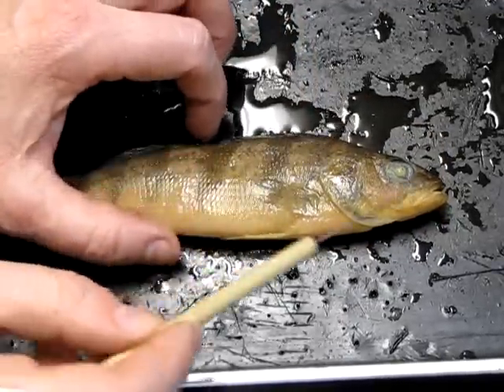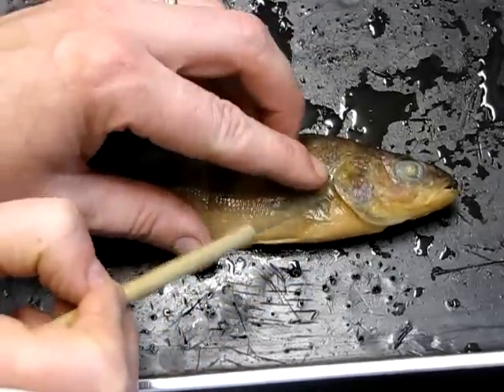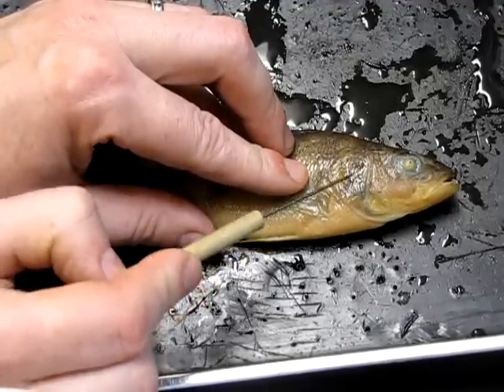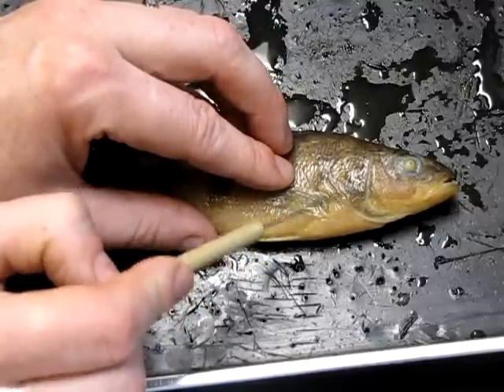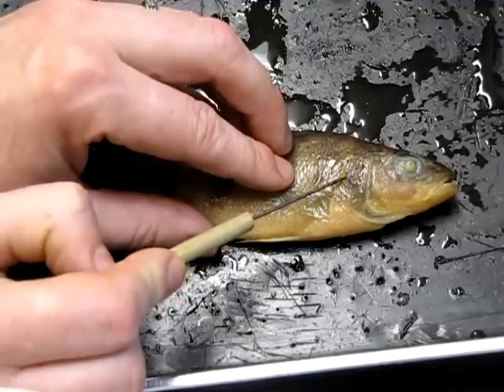Something unique to bony fish is this bony plate right here — you can see me lifting it — this is called the operculum. The operculum protects the gills lying directly underneath, which are very soft, feathery structures. The operculum provides the protection necessary for those gills.